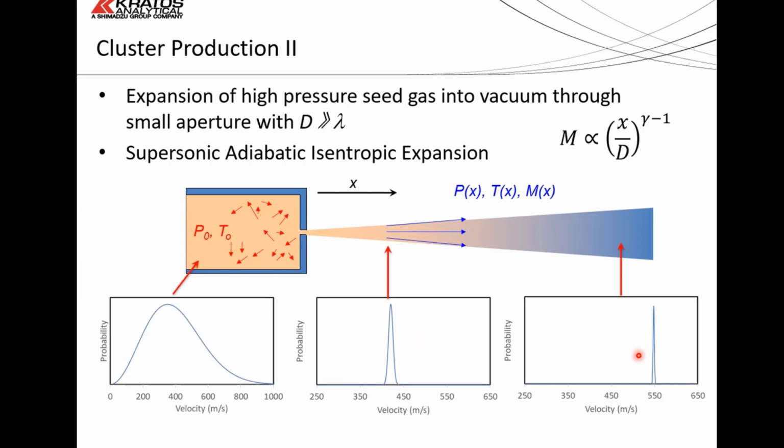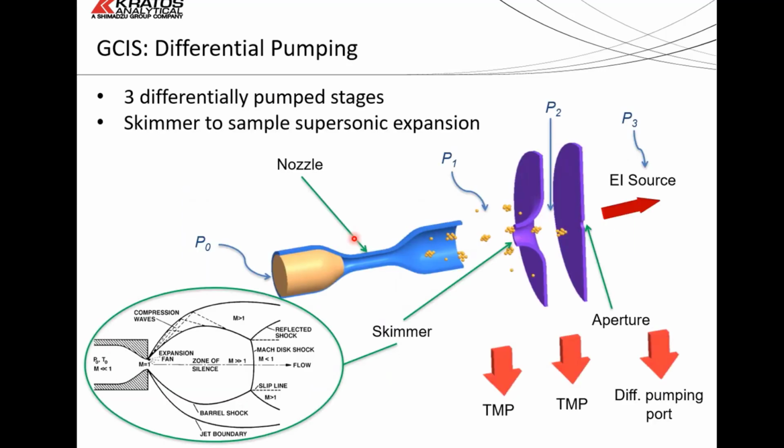So this means that all our internal energy is now in kinetic energy, and all of the adjacent argon atoms are not striking each other. In other words, they're frozen out. And so at some point within here, you'll get argon atoms colliding with each other and they'll stick and they won't fall apart because the internal temperature is just too small.